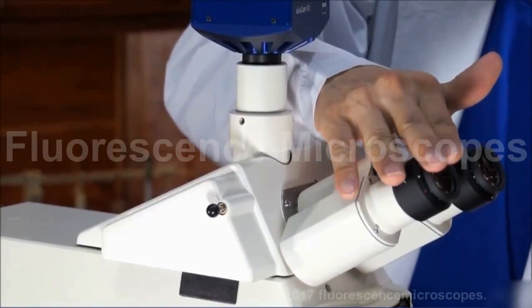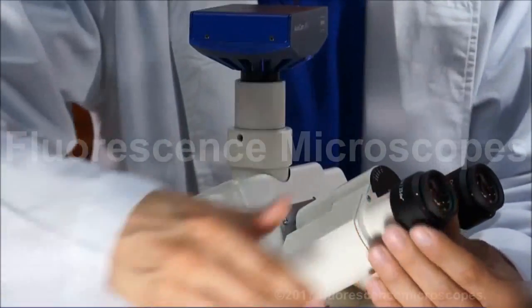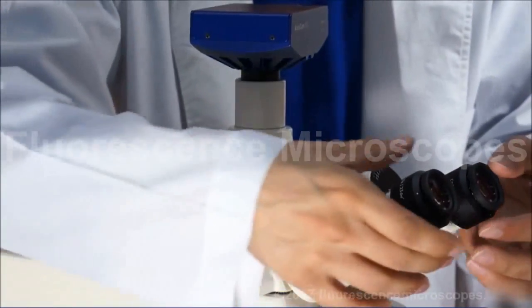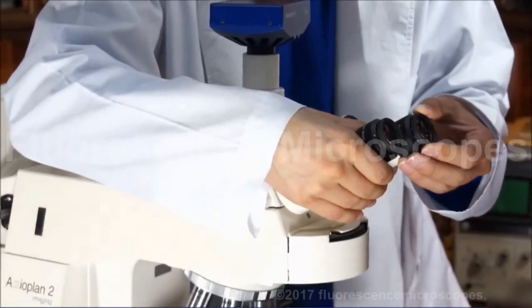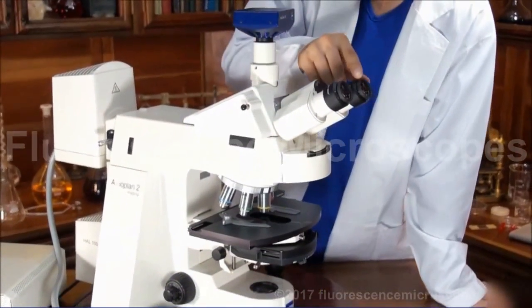You're going to want to look in one, focus the microscope, then look into your other eye, leave the focusing alone, and adjust this diopter just a little bit until the other eye is in focus.